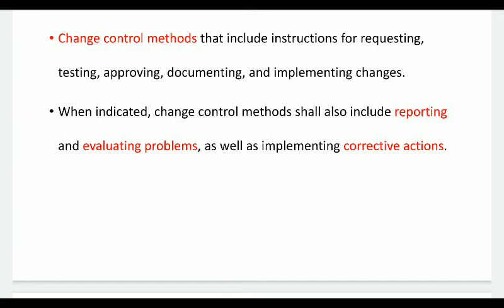Here in this context, we are buying software from an external vendor. After buying, if there is a need to make a certain change, if we want to tailor-make that software to suit our LIMS system, then for this kind of change control we have to develop a proper method. We have to first establish what the need for such change is.